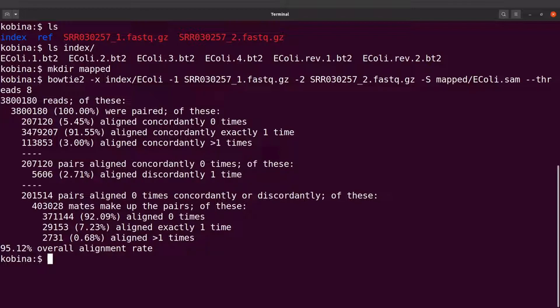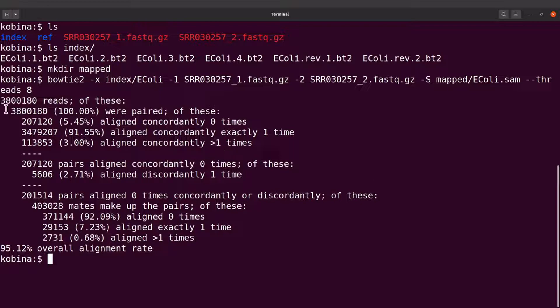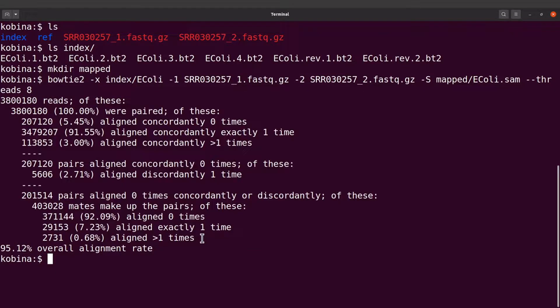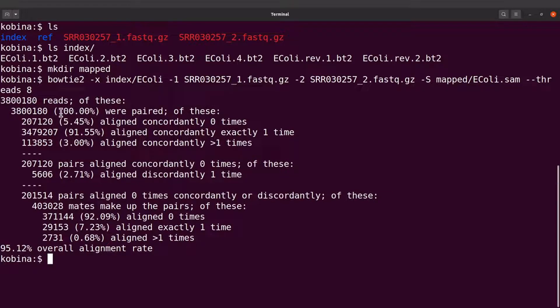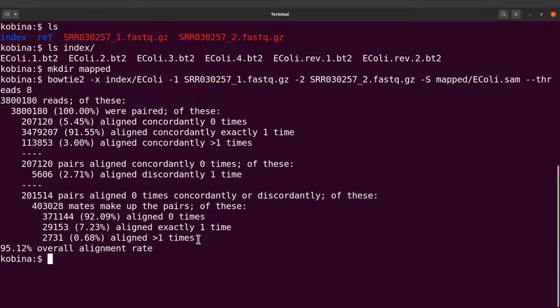Mapping has been done. Whenever Bowtie completes a mapping activity, it gives us a summary of what has happened. Here we have some statistics. We are dealing with paired reads, so Bowtie tells us the percentage of reads that were paired - here it says 100 percent.